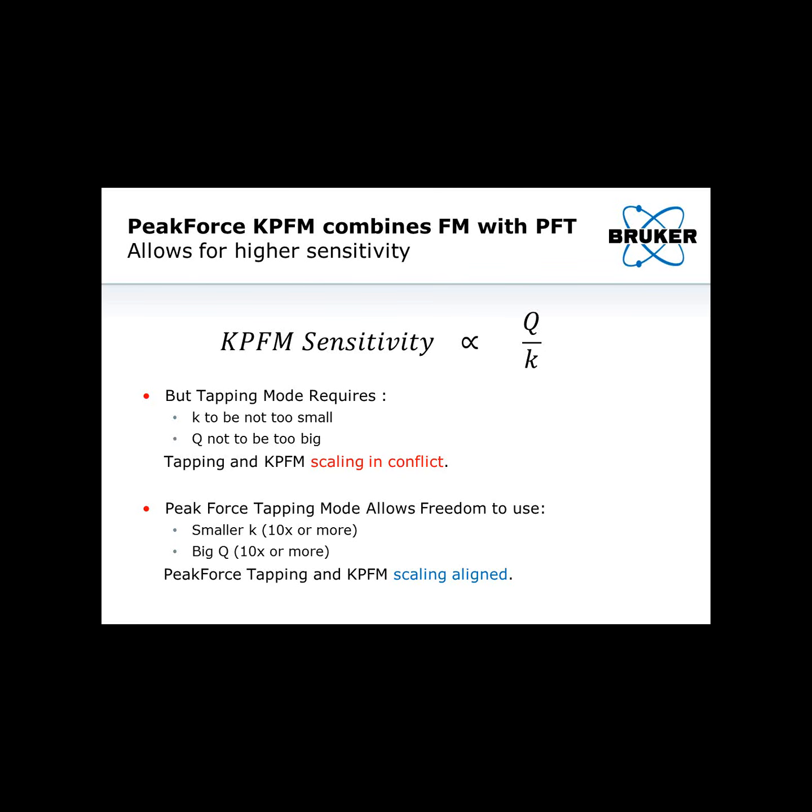However, if we use PeakForce tapping, we can use pretty much any tip we want, and we can optimize this simple relationship to optimize the KPFM sensitivity. And in addition, we have access to all the great features of PeakForce tapping, like we can get all these additional channels, such as adhesion or modulus, which give us additional information about the mechanical properties of the sample.